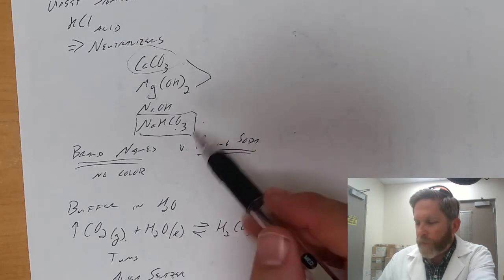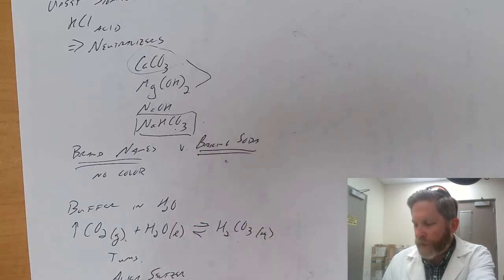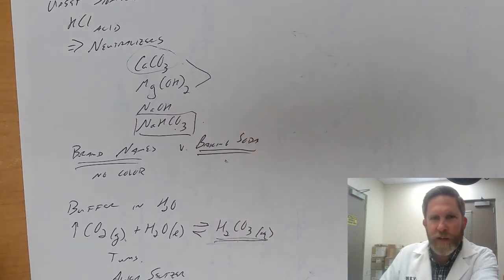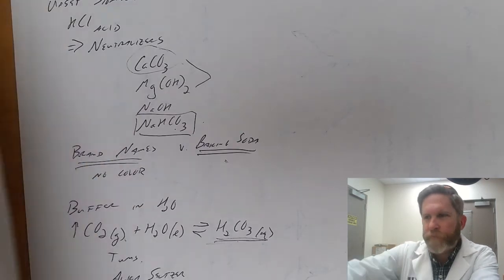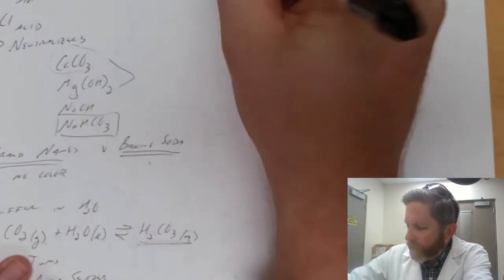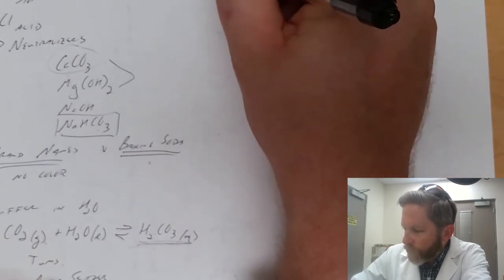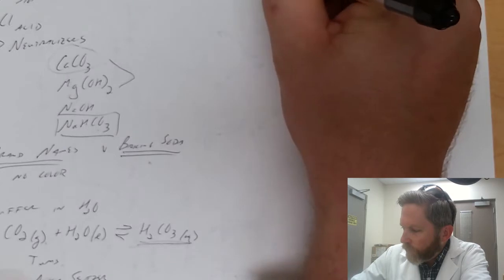And so whether we're using baking soda or these two brand names, we're going to have to heat them in order to drive off all of this secondary acid that we create as a consequence of adding it to the acidic environment in our cells. So for purposes of today's experiment, it'll be two parts, so I'll go ahead and draw them all up front.